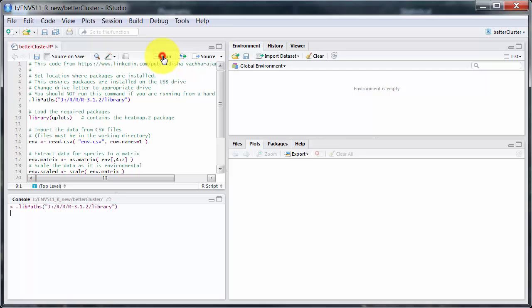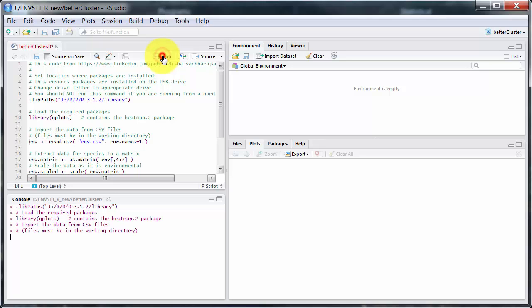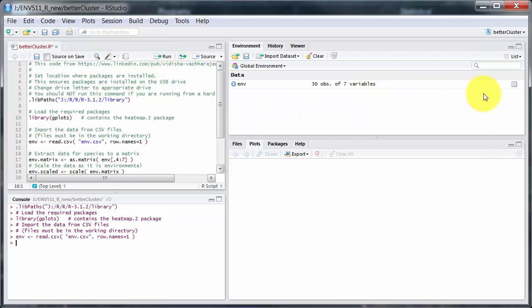That libPaths is only relevant if you're running off a USB stick, as I am here. We use gplots, that contains the functions she's using, or actually the heatmap.2 package. I'll load in my data file.